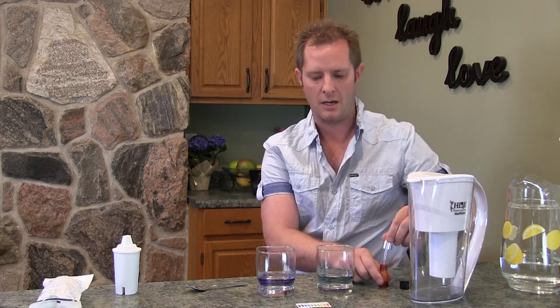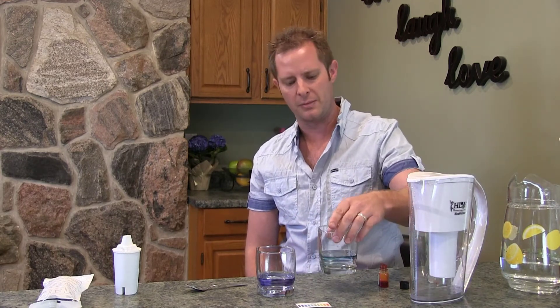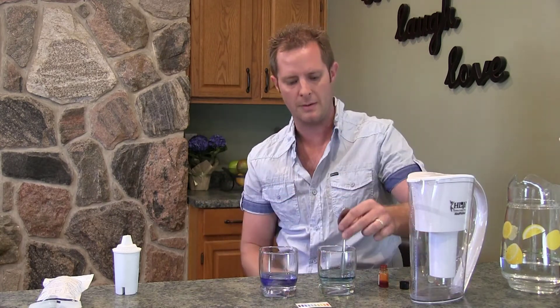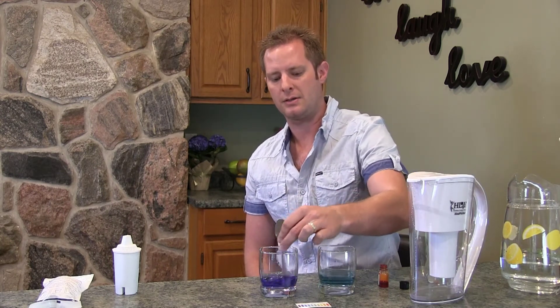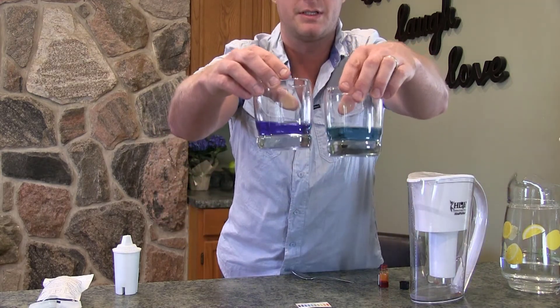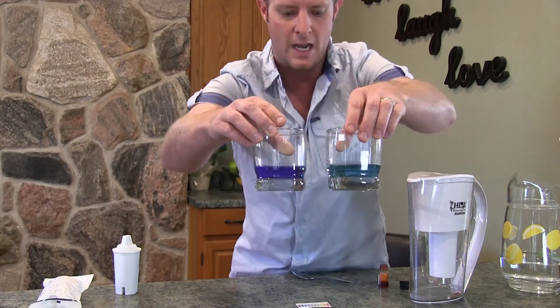You can definitely see the difference. The tap water is a lighter greeny-blue color, and the Alka Pitcher water has gone a dark, dark blue. I like to use a spoon to mix it around, and you can clearly see the difference in that water.